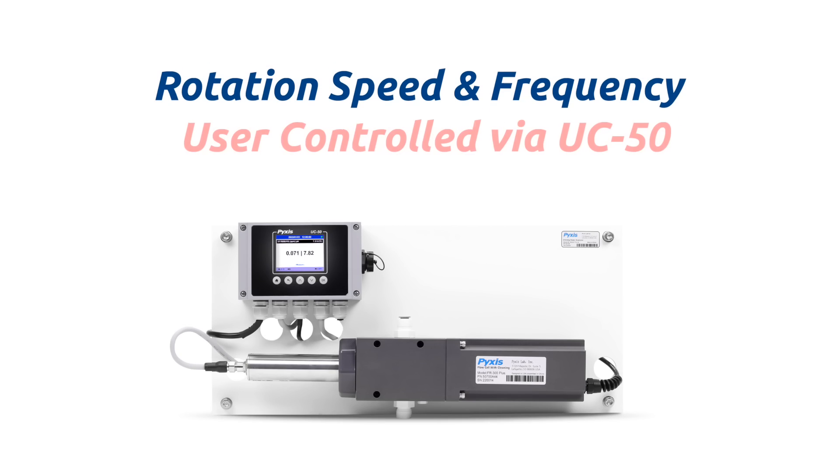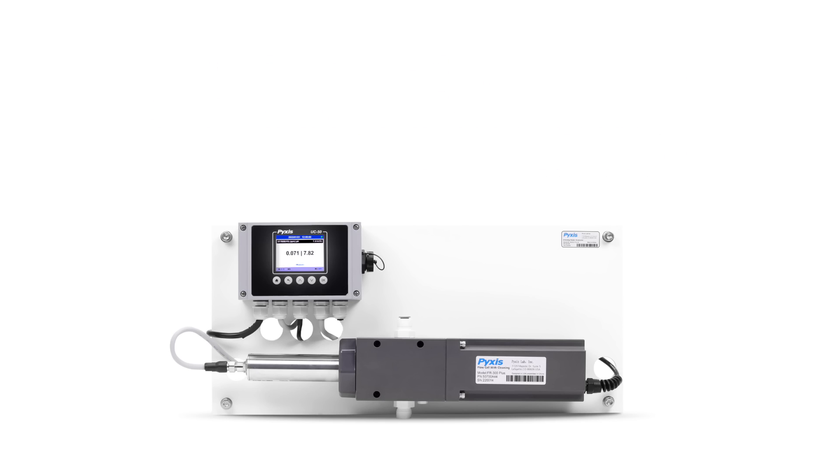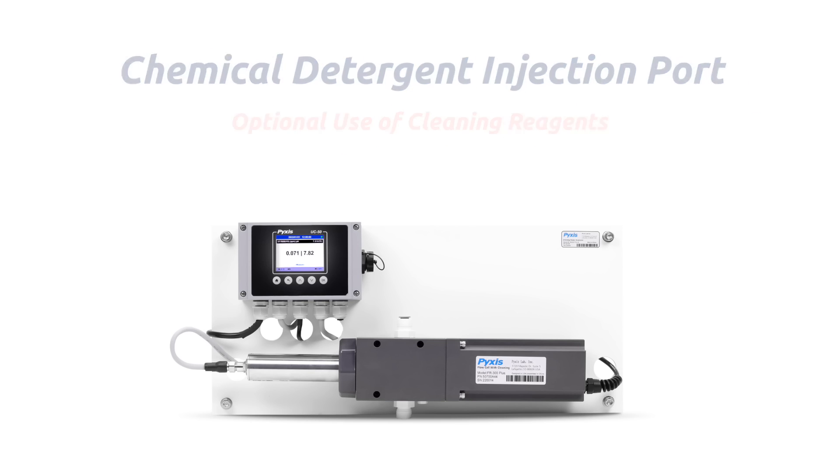The brushing frequency and rotational speed may be user-controlled from the UC50 display interface for various application needs. The FR300 Plus also contains a chemical detergent injection port in the assembly housing, allowing for the optional injection of cleaning agents at the brush head in extremely challenged industrial waters containing fats, oils, and grease.